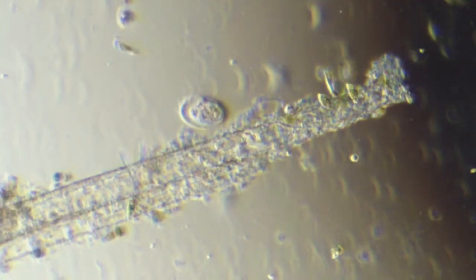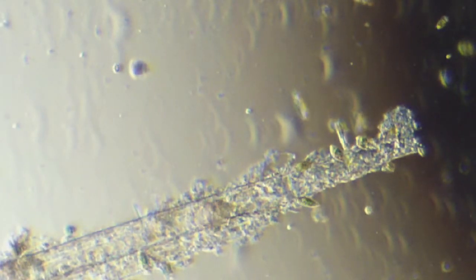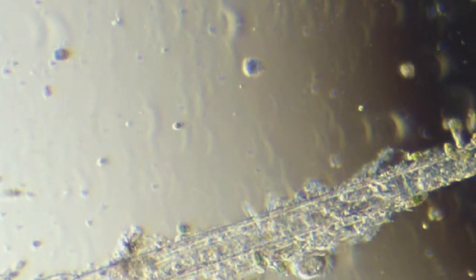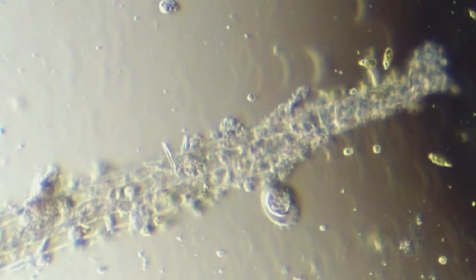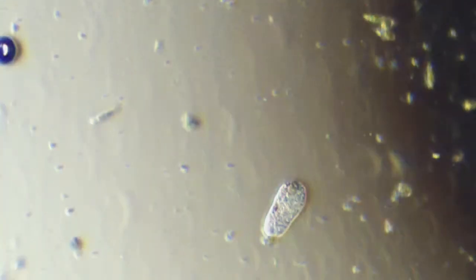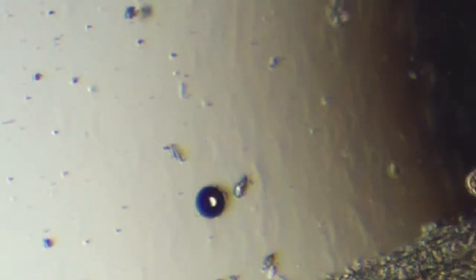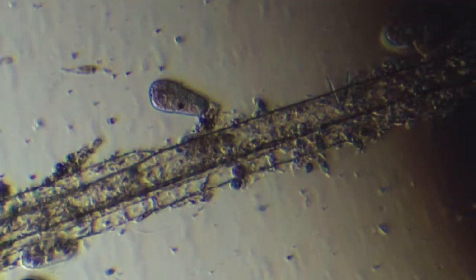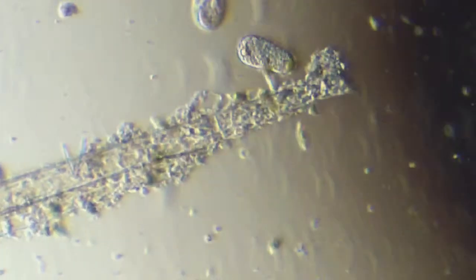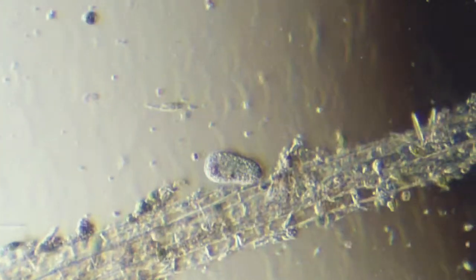See how it's squishing itself up on the end, and you see the flat edge flipping up? Showing a 3D effect. It's trying to basically swim over that decaying material. And you can see how flat it is and concave. Oh, another cool one there. Look at that guy. It's also checking out the debris, looking for tasty treats. Now they're together. See the size comparison. I don't know the names of these two. I've looked them up, but I've seen them before. Really cool. This one, see how it kind of spins as it swims. Even though it's a ciliate, sometimes they spin, sometimes they kind of go straight line.